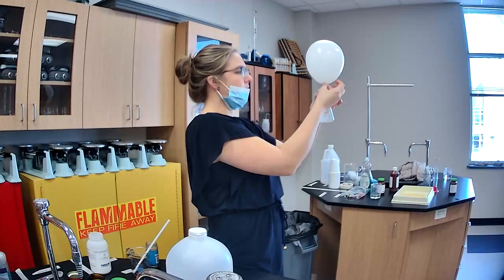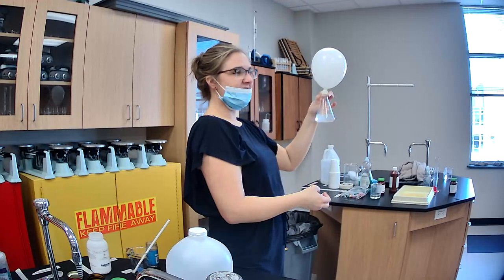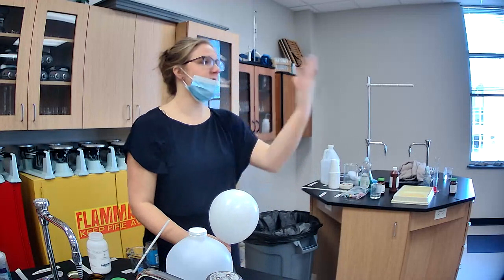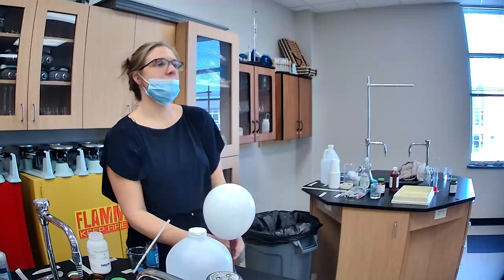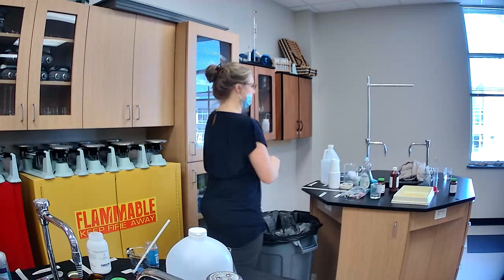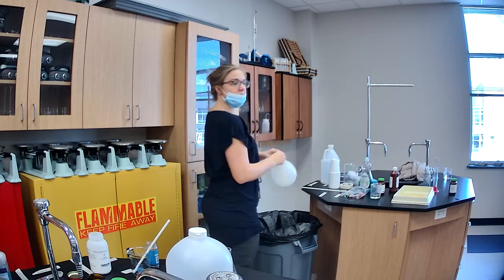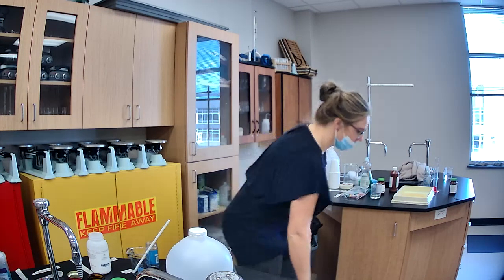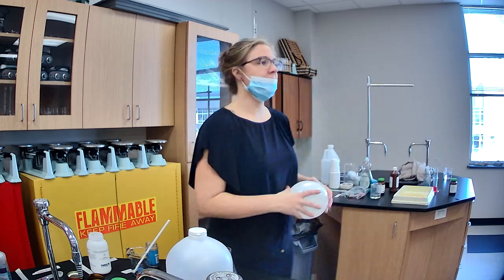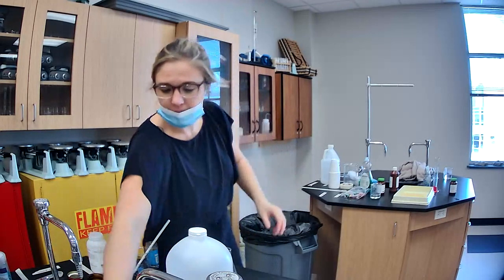Now, there's a little hole in the bottom of it, so it's leaking. You hear it? I hear it. Yeah. The reaction produces carbon dioxide gas, the same kind of gas that we expel when we breathe out. It's the same as if we were to blow the balloon up with our mouth. It's heavier than oxygen.